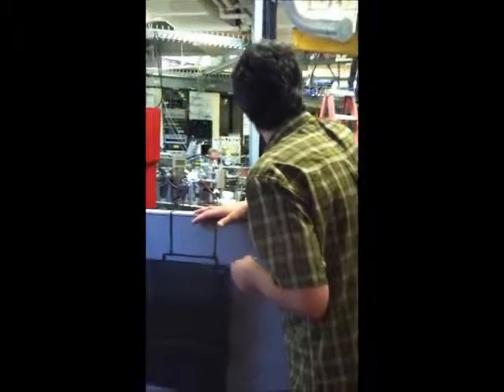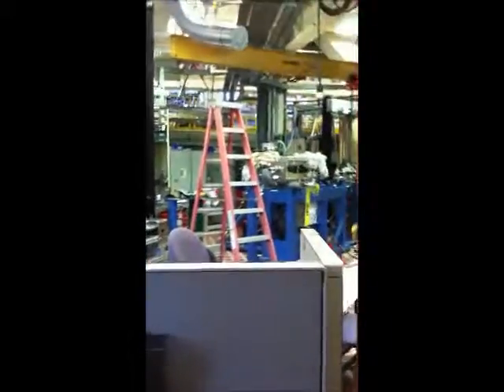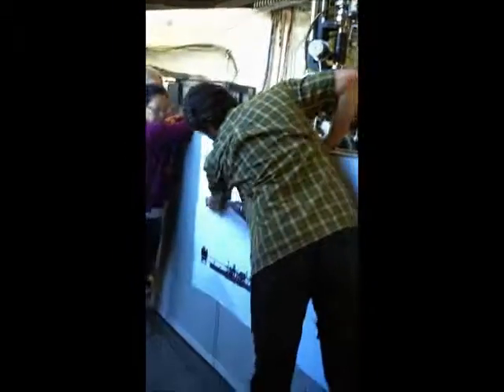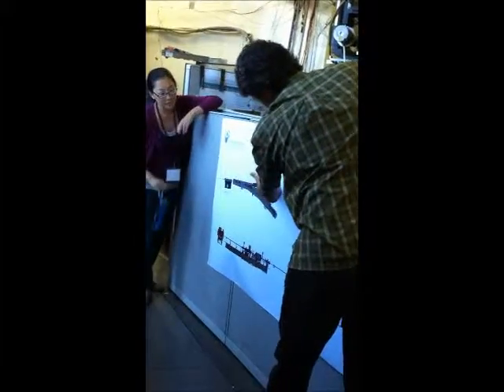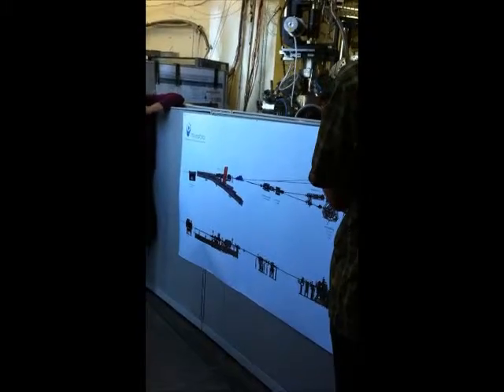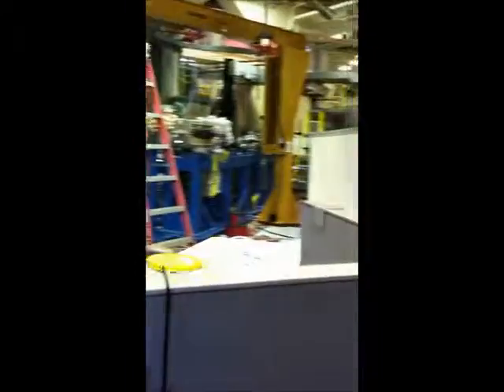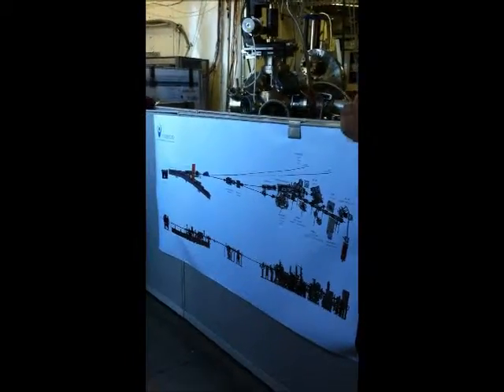So, beamline in progress. One thing I can actually show, so you guys can get the sense of the beamline: here's a CAD drawing of it. This is the storage ring, so this is where the electrons are going around. It's one section of the storage ring. And then the beam of radiation is coming down through all these manipulative optics into the chambers. One thing you might question is the beamline is quite long, actually. You can see where it comes out of the concrete shielding down there, and eventually there's going to be a chamber here. One reason these beamlines are long has to do with the fact that these are X-ray microscopes, right?